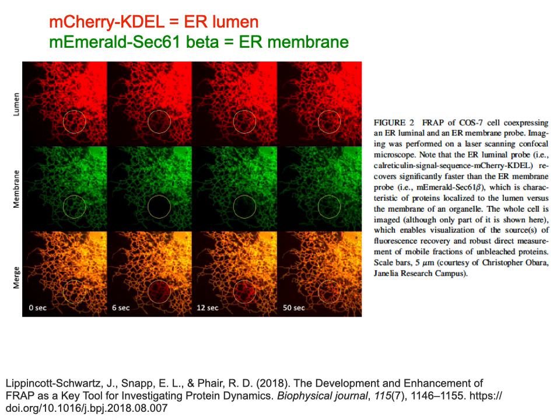So we do want to keep in mind that these fluorescent dyes and these proteins have some mass. And also depending upon the quality of the microscope, how small the plane of view is, it may not actually be co-localizing in the same location, in the same general location, if that makes sense. And I'll touch upon a little bit more about that in a moment.